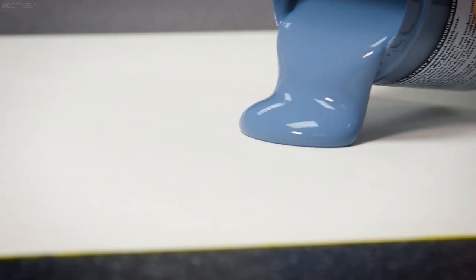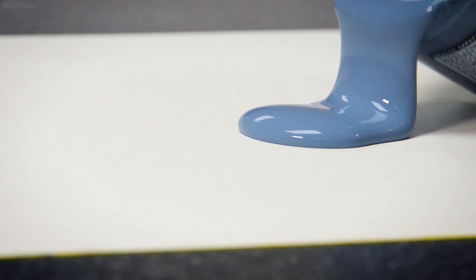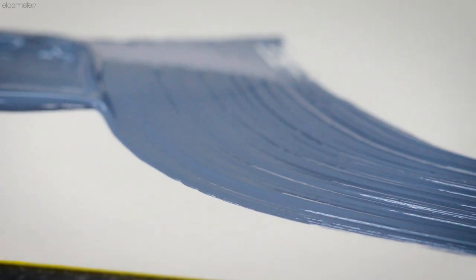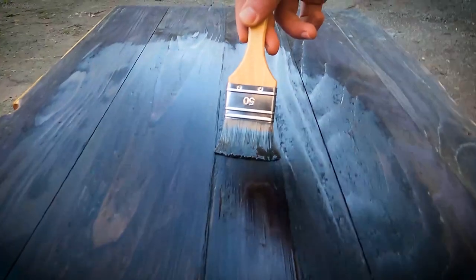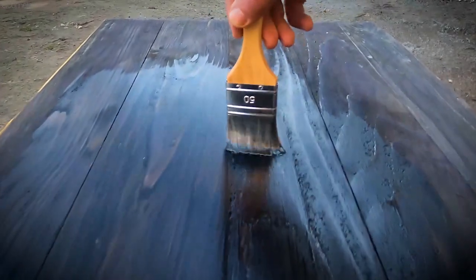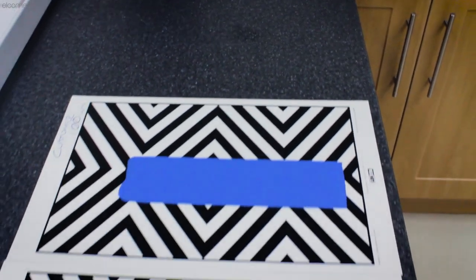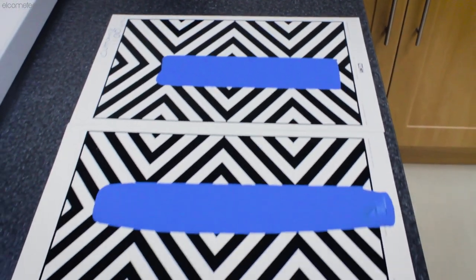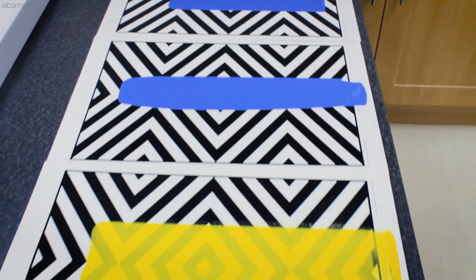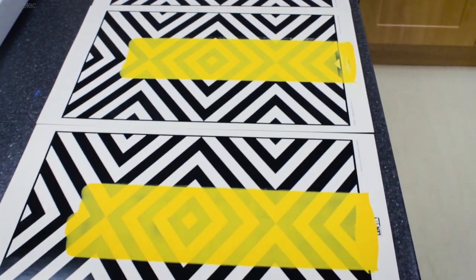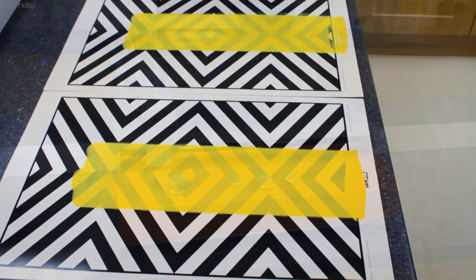When developing products such as paints, varnishes, cosmetics, or glues, it's typical to test their properties as part of their development. It's important to ensure that consistent, repeatable, and reproducible films can be made in order to undertake fair and accurate tests. This is where the Elcometer 4340 motorized automatic film applicator comes in.